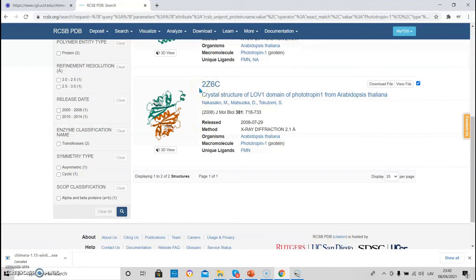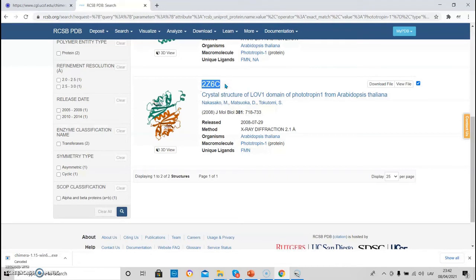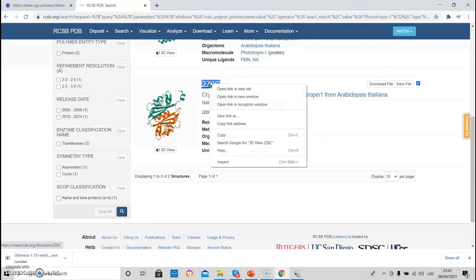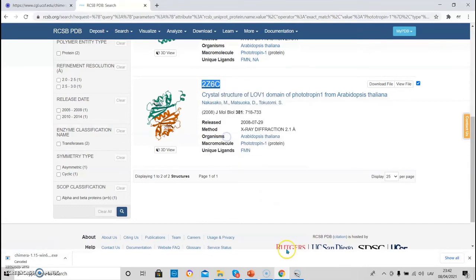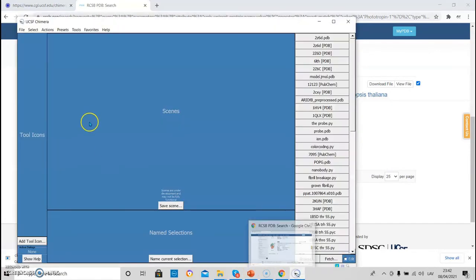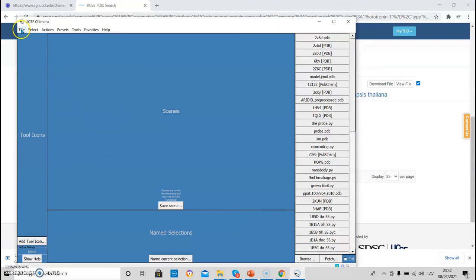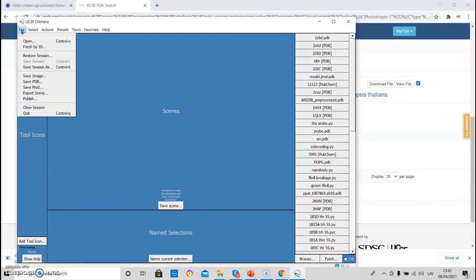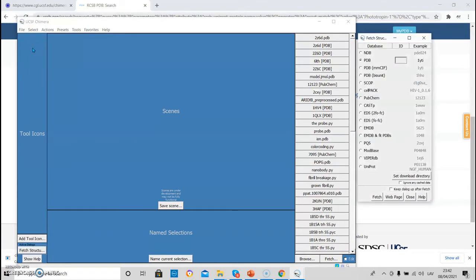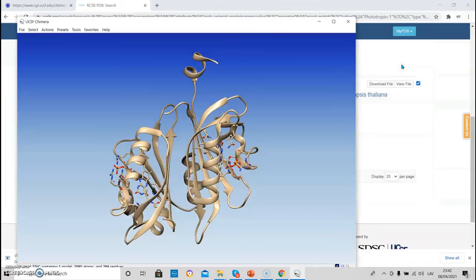There are two ways how to load this structure into Chimera. First, you can just copy the structure ID. Control copy. And go to Chimera file, fetch by ID. And you have to choose PDB which corresponds to the PDB database. And just paste here the structure.